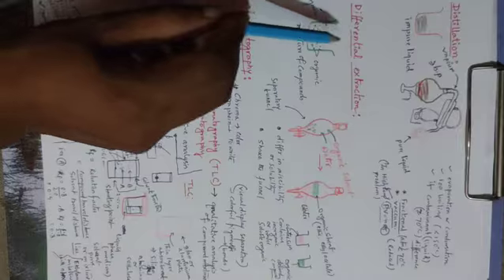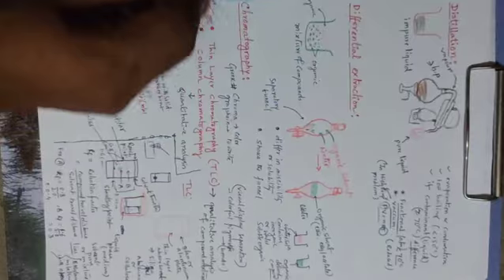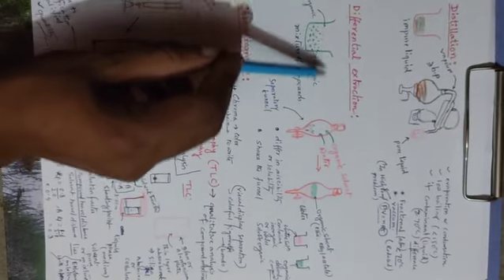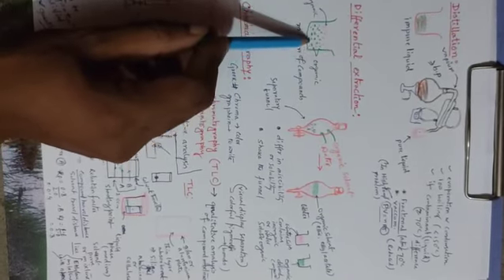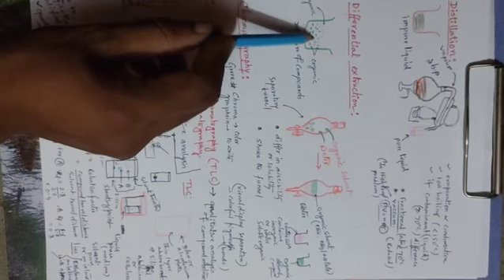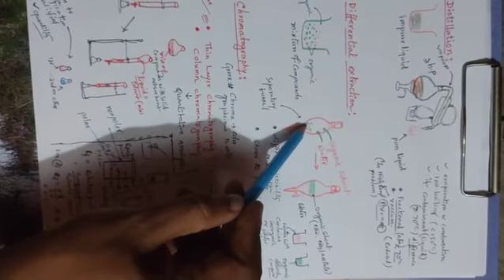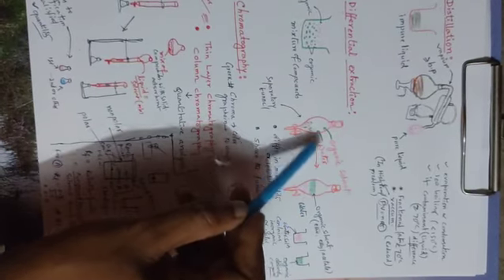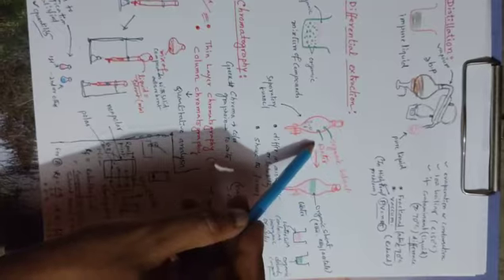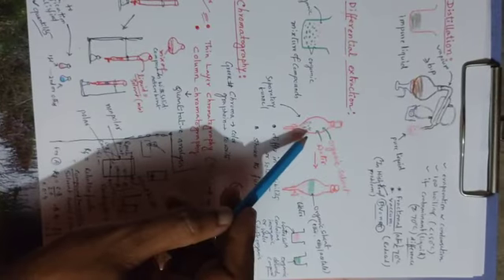So next we will see differential extraction. How can it separate our organic compound if there is a mixture of compounds, inorganic or multiple organic compounds? From that mixture we can put it in the separatory funnel. This is called a separatory funnel. We put in the mixture, then we put the organic solvent and the other is water. The basic fundamental here is the miscibility of our compound.